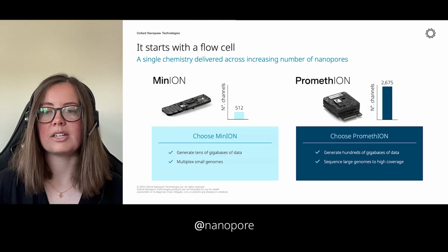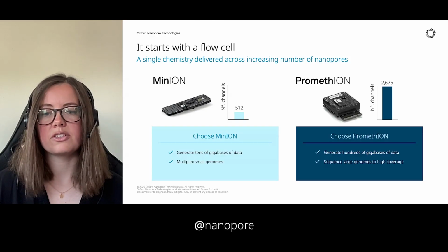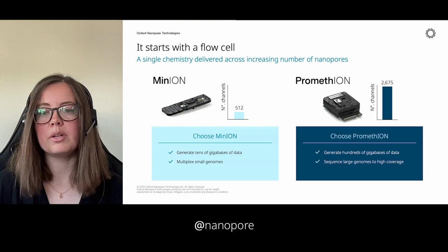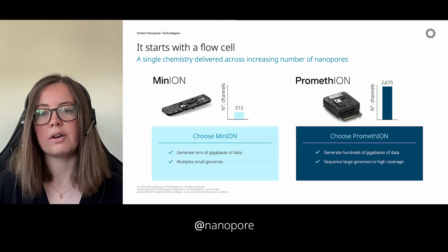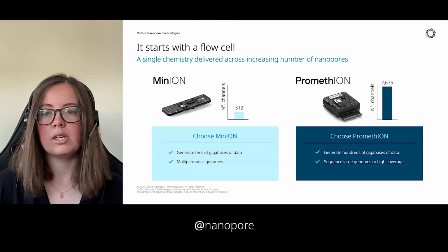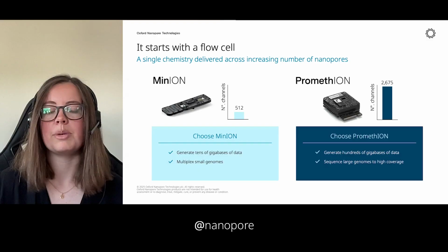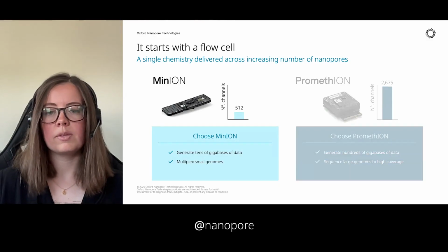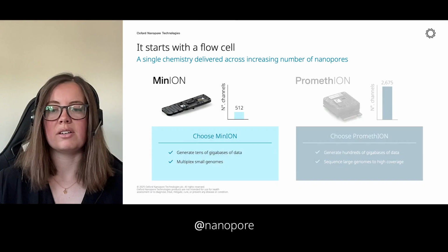Up to 96 plasmids can be sequenced using one of these flow cells. In contrast, PromethION flow cells are capable of generating 100 plus gigabases, enough data for high coverage large genome assemblies. For higher throughput needs, you can choose to optimize your plasmid sequencing workflow for use with higher output PromethION flow cells. Here we'll proceed with our standard protocol and look at the sequencing on a MinION flow cell.